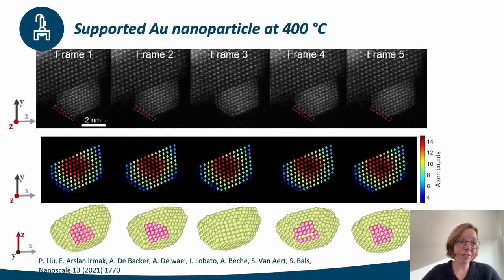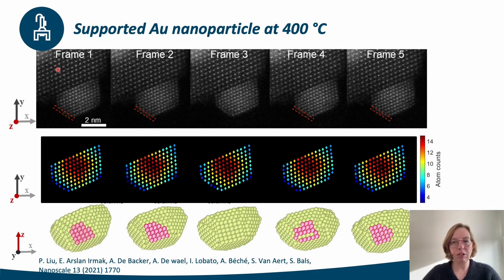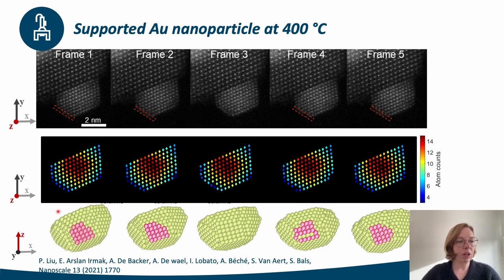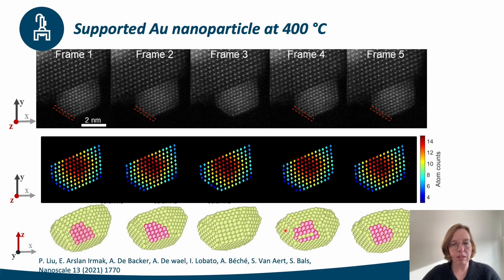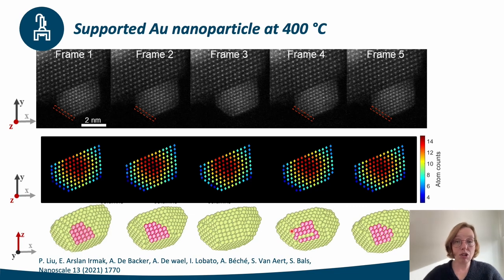Finally, we investigated a time series of supported gold nanoparticles deposited on cerium dioxide at 400 degrees Celsius. Using the hidden Markov model, we could obtain atom counts, which were used as input for 3D modeling, visualizing the process where an entire (100) plane disappears and reappears. The 3D models show that this layer jumping is accompanied by a significant change in the surface structure and size.